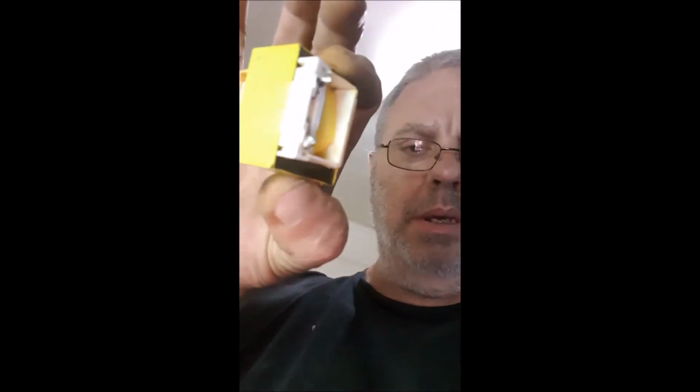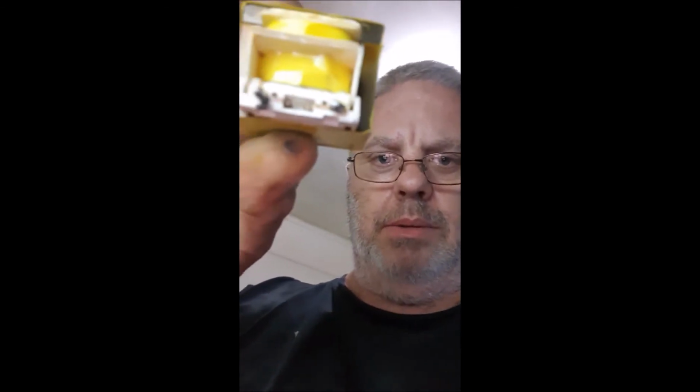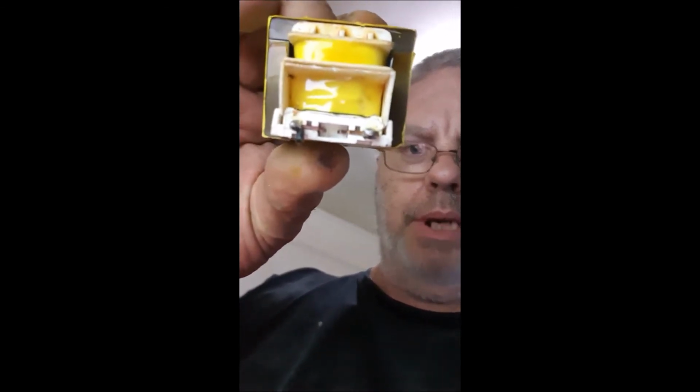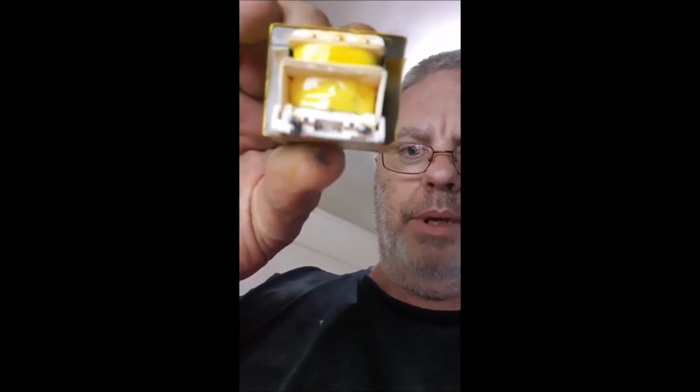what I'm using. If some of you guys have pulled computers apart before, or TVs and things like that, you would have seen these type of... I can't think of the name of them now. I just had it in my mind a minute ago. Transformers, okay? Now, these ones have got metal sheets. They sort of go around the transformer and then through the middle of it.